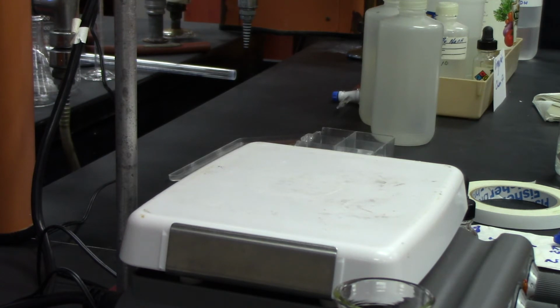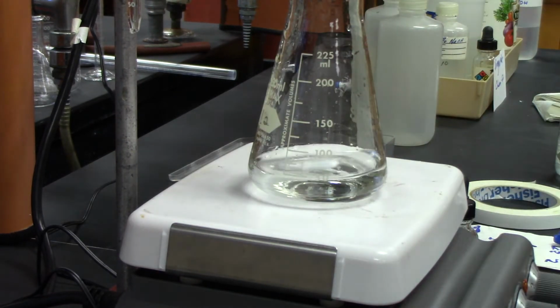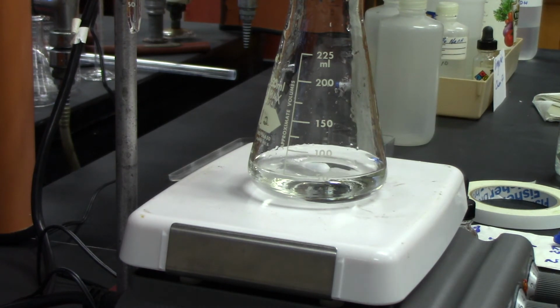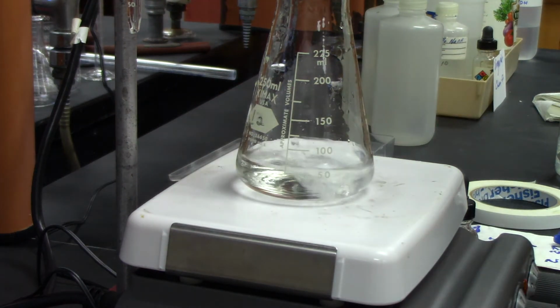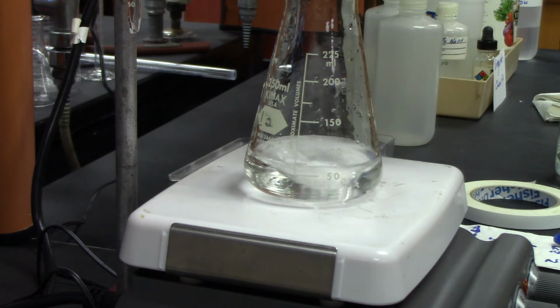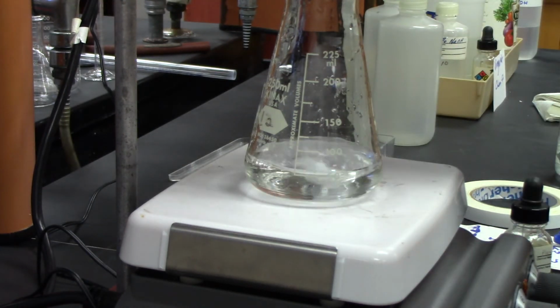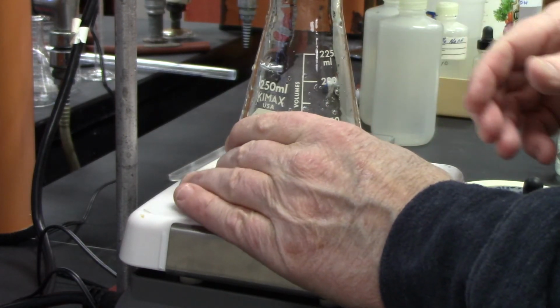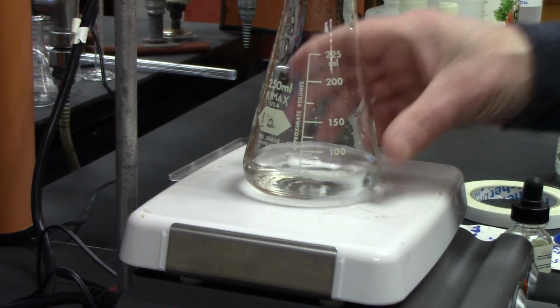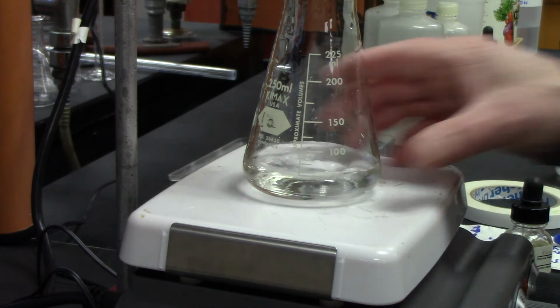Okay, so my starting volume is 0.50. All right, got my acid going at 3. 1, 2, 3. Okay, now I'm gonna start adding my base. Right now, just notice the experimental technique. We'll go over the results and calculations separately.